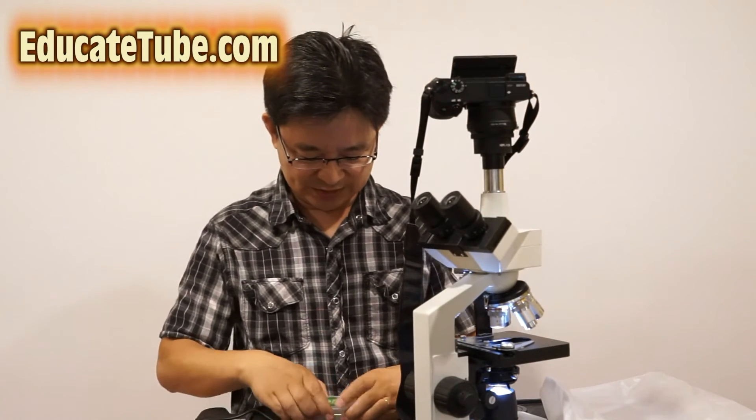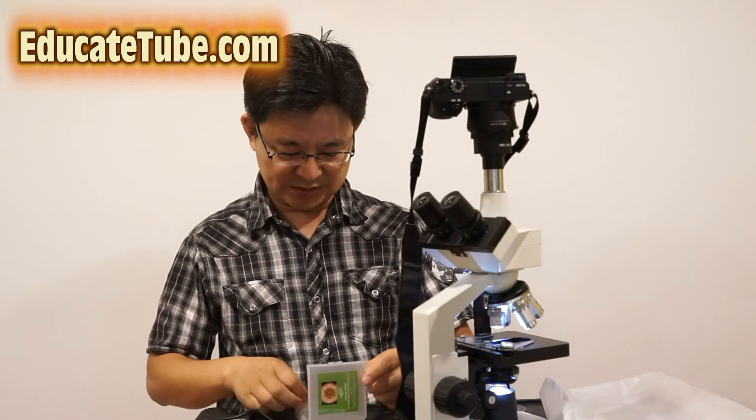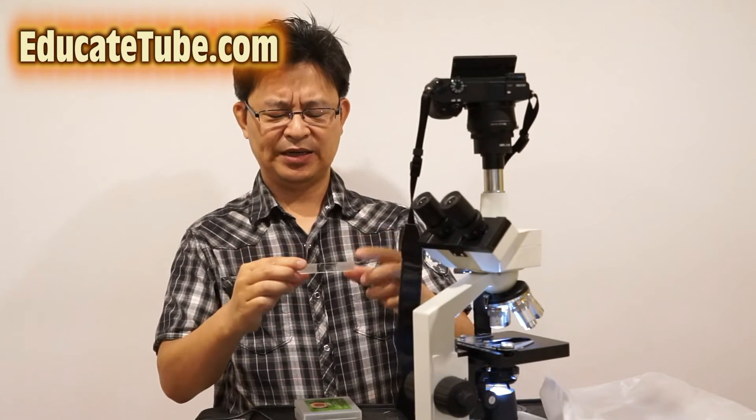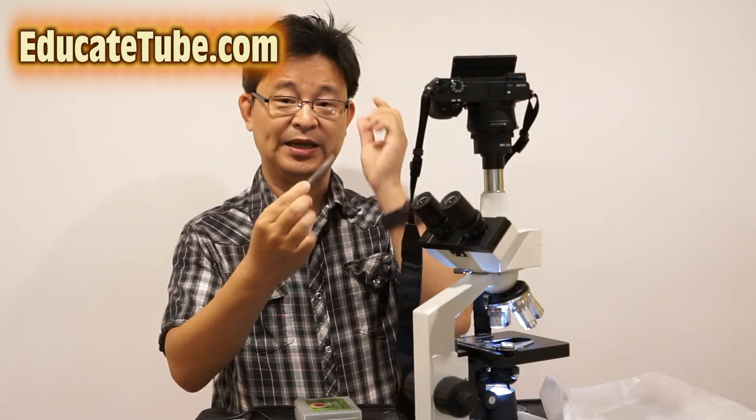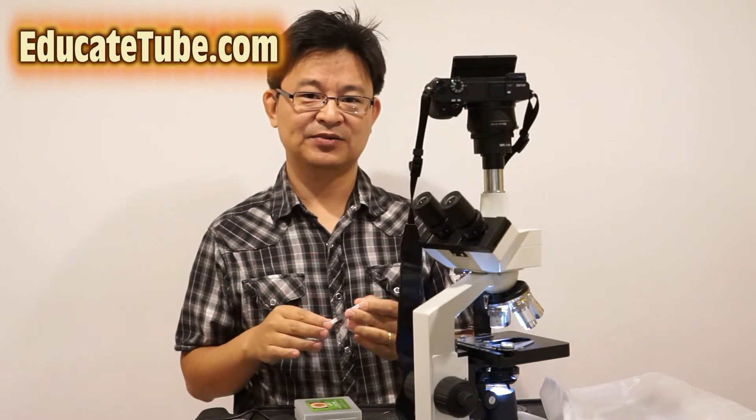I'll take one of the slides I have — we're going to see some specimen. Right here I have a Honey Bee Worker Leg specimen that I bought. It comes with about 100 different slides of different specimens.